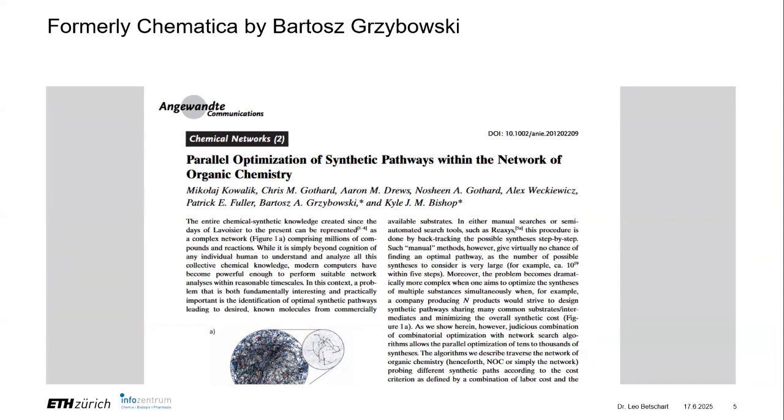So this is a paper from 2012, and they initially developed this software under the name Chematica, and it was then at some point bought by Merck and rebranded.